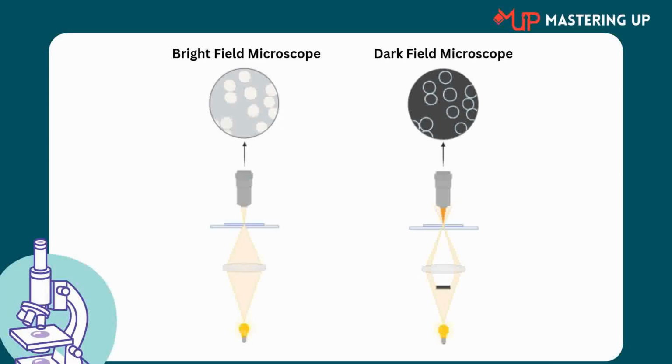It is also known as a compound light or bright field microscope. The bright field is actually one of the simplest microscopes. Despite this, they can blend well with new technologies, including digital imaging systems. The bright field microscope uses light rays or beams to create dark images against bright backgrounds.